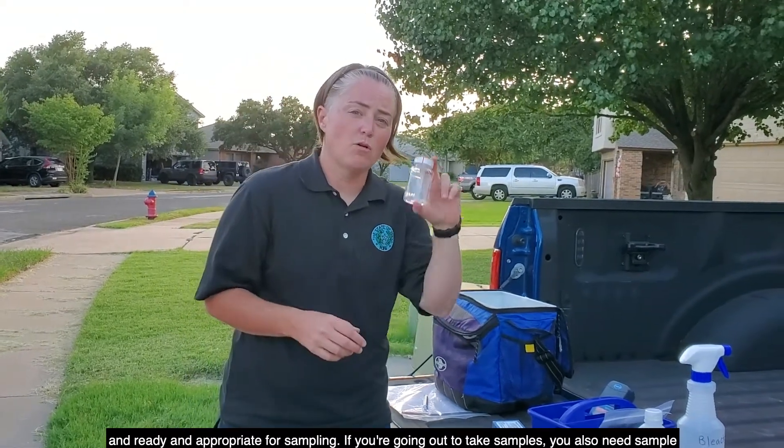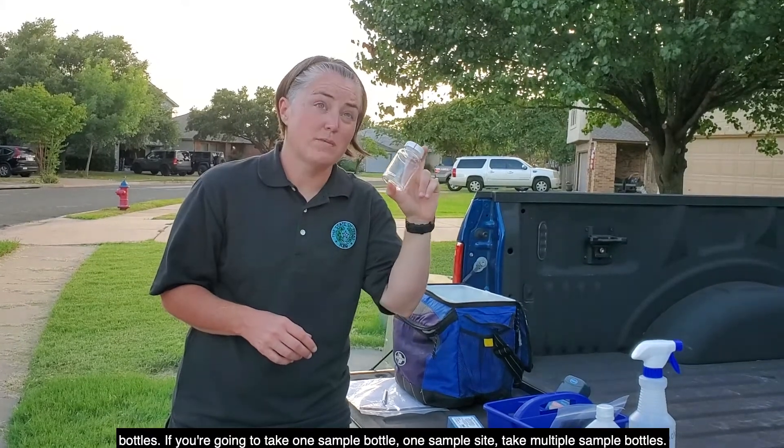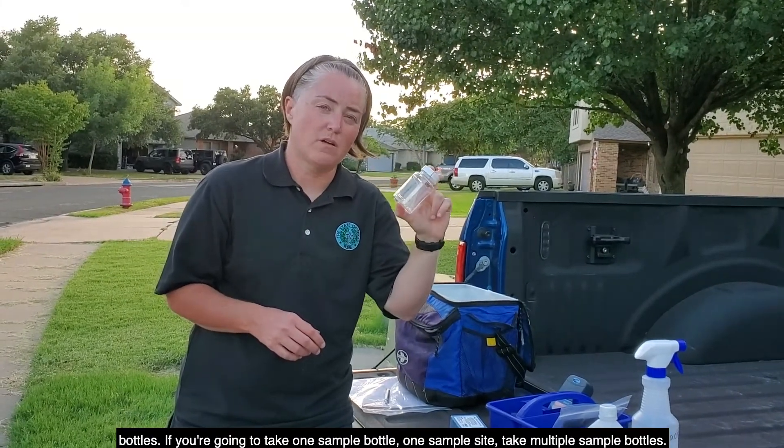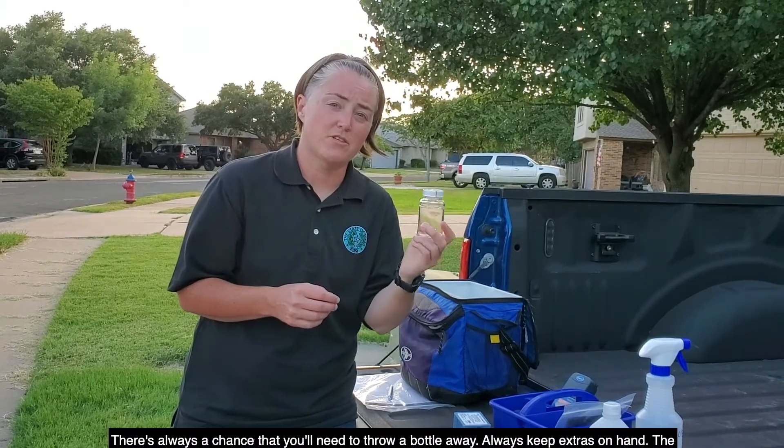If you're going out to take samples, you'll also need sample bottles. If you're going to take one sample bottle at one sample site, take multiple sample bottles. There's always a chance that you'll need to throw a bottle away. Always keep extras on hand.